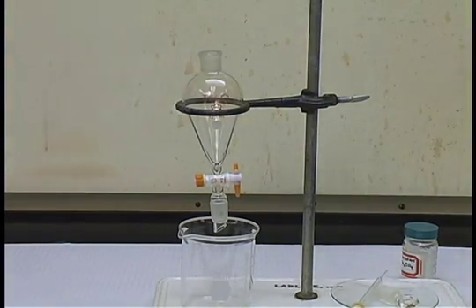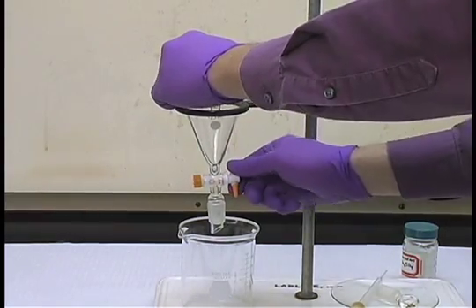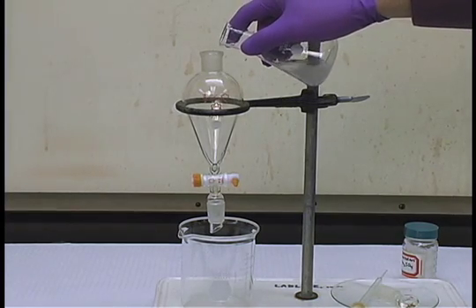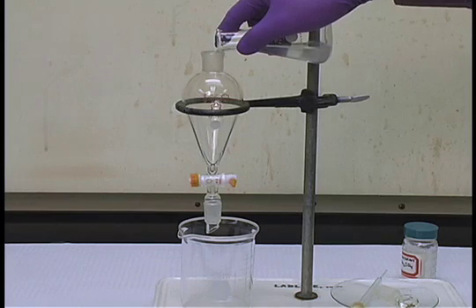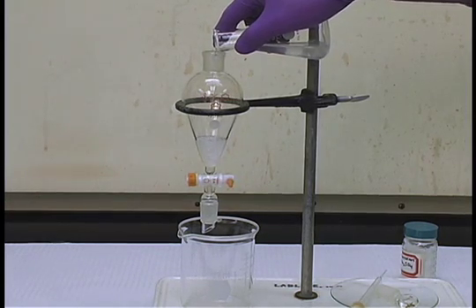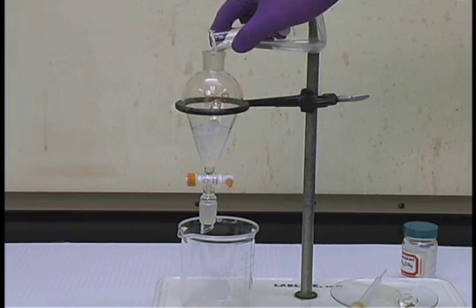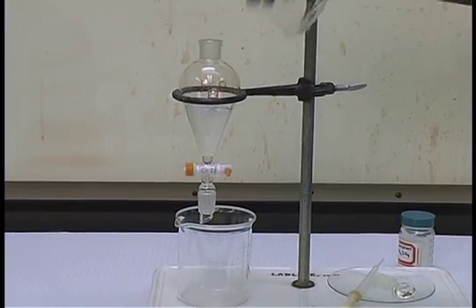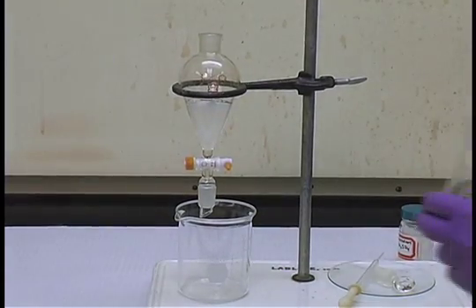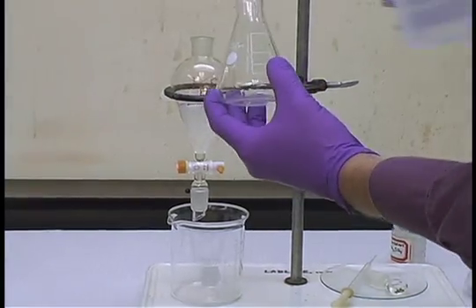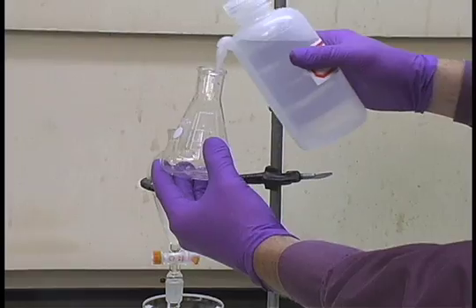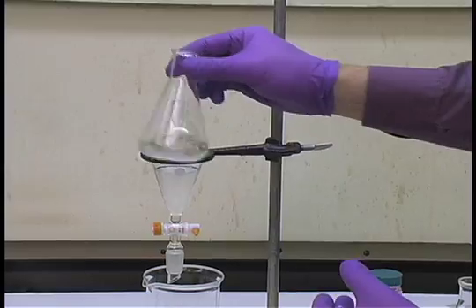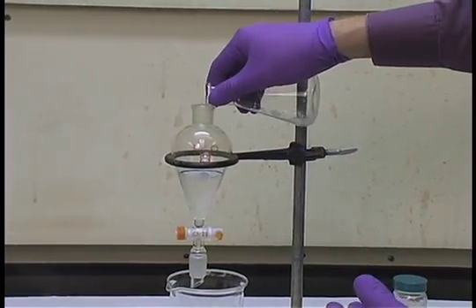When ready to do the extraction, close the stopcock and then pour in the solution to be extracted. In this particular case, it's an aqueous solution, so carefully add the solution, and then rinse the flask with additional solvent to remove any excess solute, swirl, and then pour that into the separatory funnel.